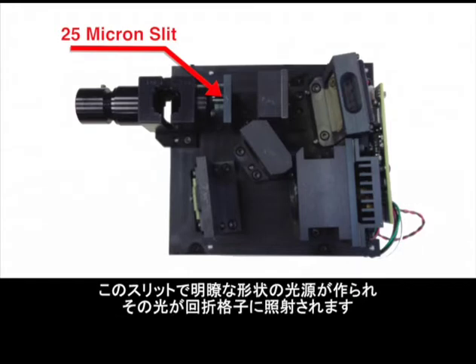The slit provides a geometrically sharply defined source of light, which then shines on the diffraction grating. The width of the slit preceding the grating in the optical path is the key factor in determining the wavelength resolution of the acquired spectrum. Wider slits, such as 50 microns, allow more light through for faster scans and/or higher sensitivity. Smaller slits, near 10 microns, trade off light throughput for improved wavelength resolution.